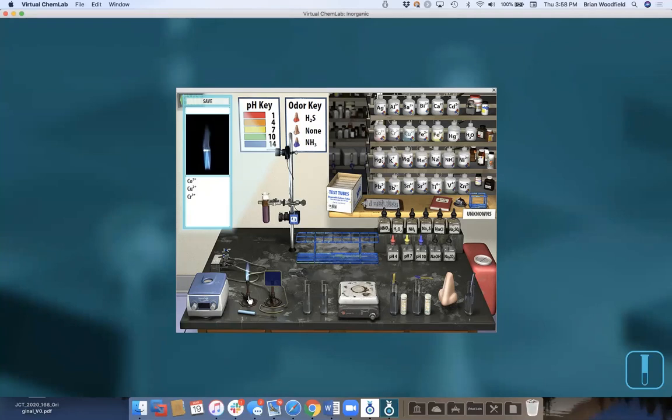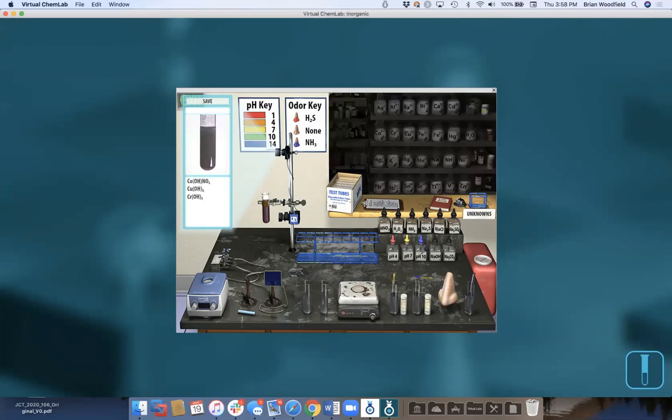So it's all designed around qualitative analysis, but the purpose of qual is to teach them the reactions of the chemistry. So you can also add these reagents. You can heat it up, smell it, measure pH. And so I can go pH 10 or NaOH, or go back to pH 7, and we'll show them, so this is based on all real chemistry. Like that Rutherford experiment was real chemistry. Those spectra were real data. And so this is what's behind these labs.